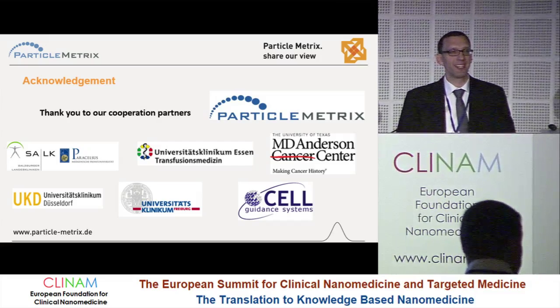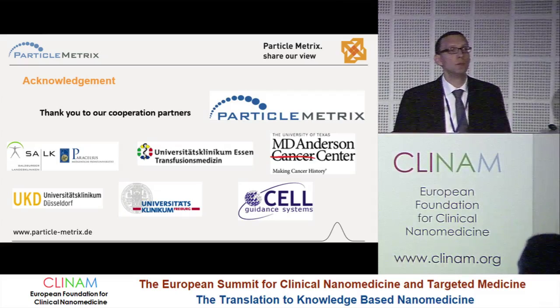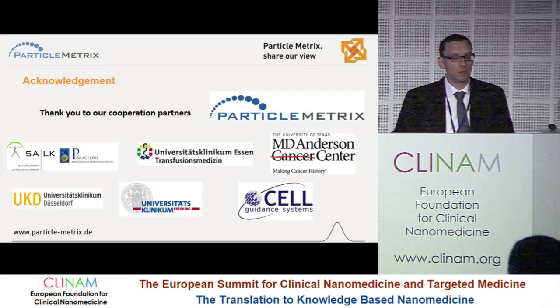Hiya, Clemens. I was just wondering, I saw the slide on fluorescence, and I noticed in the video clip there was Brownian motion, of course, but it was static except for Brownian motion. So how do you deal with the fact that the fluorophores, when they are illuminated by laser, will photo-bleach very quickly? Well, that's a question, essentially.